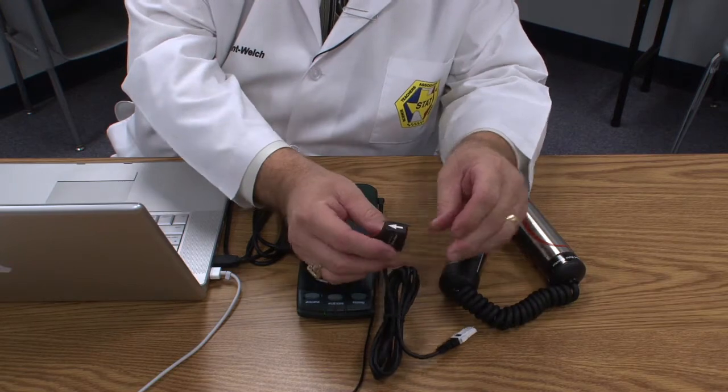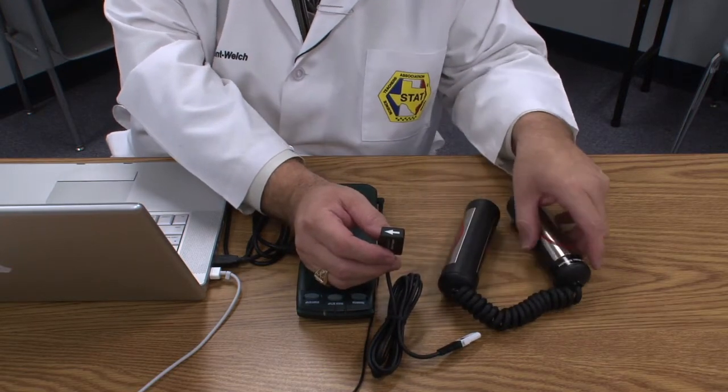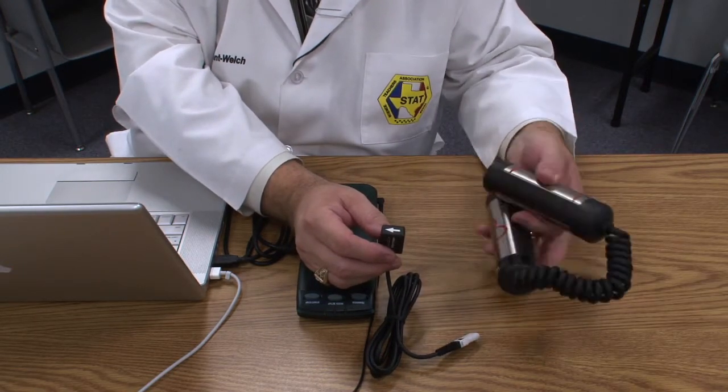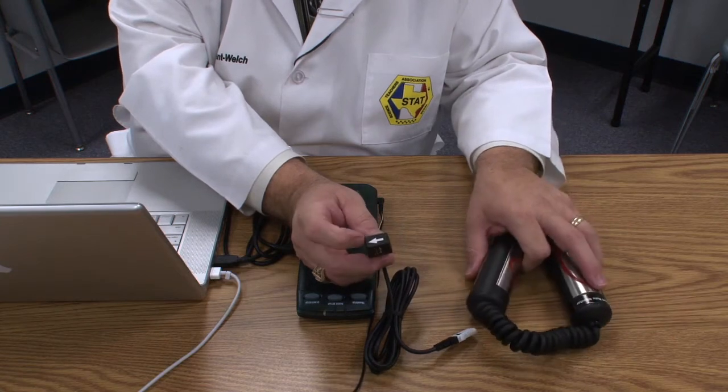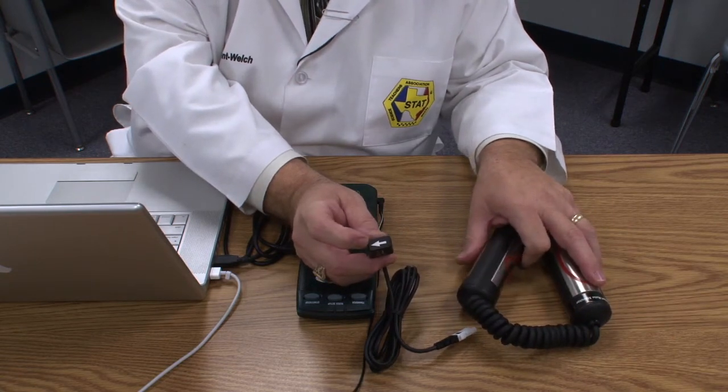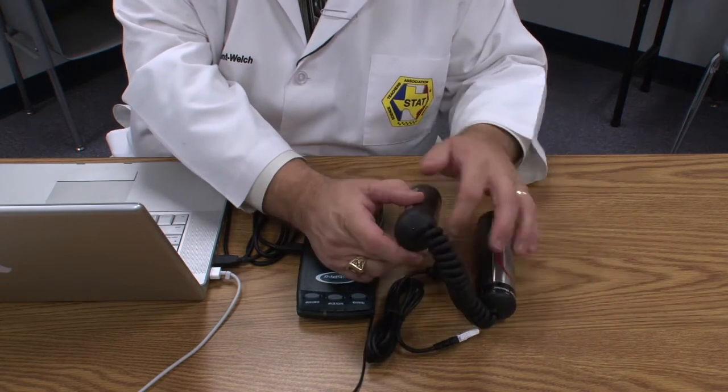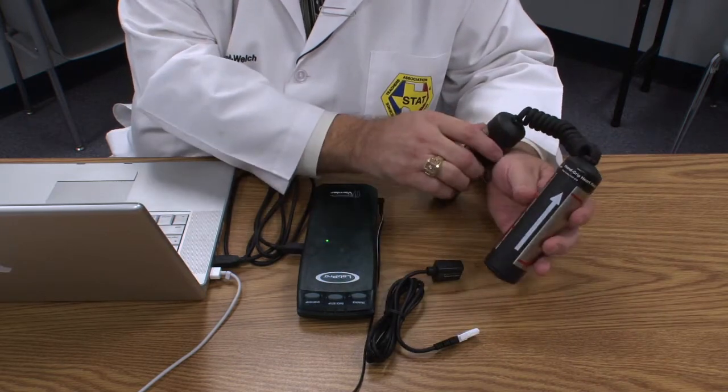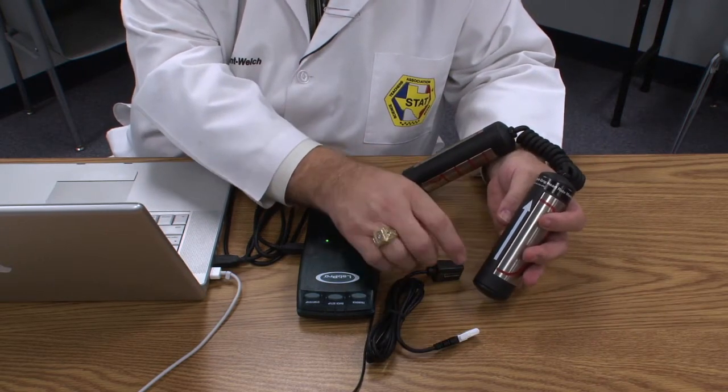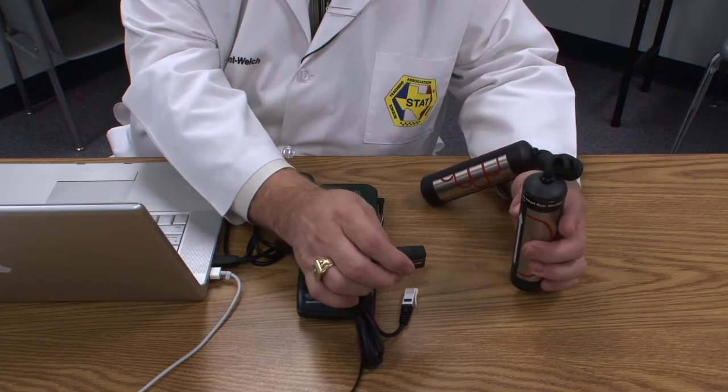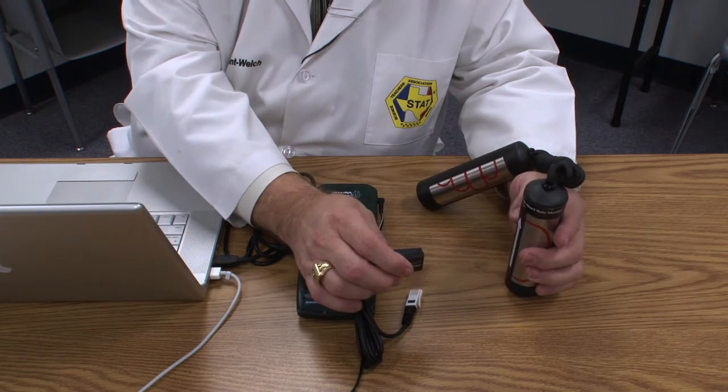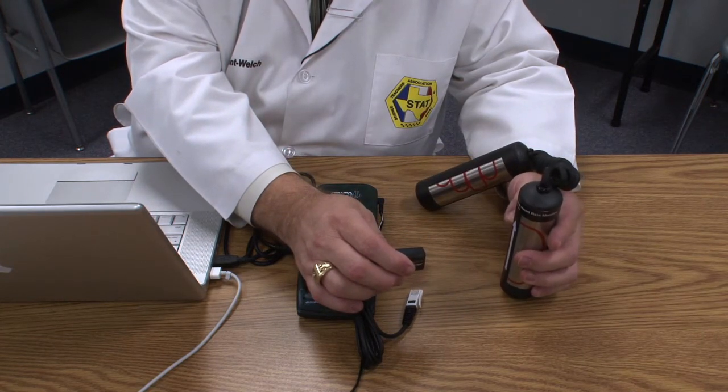If you have this probe, you'll notice there's a white arrow on the sensor and on the left-hand controller. This white arrow must be lined up with that white arrow for it to pick up a signal.